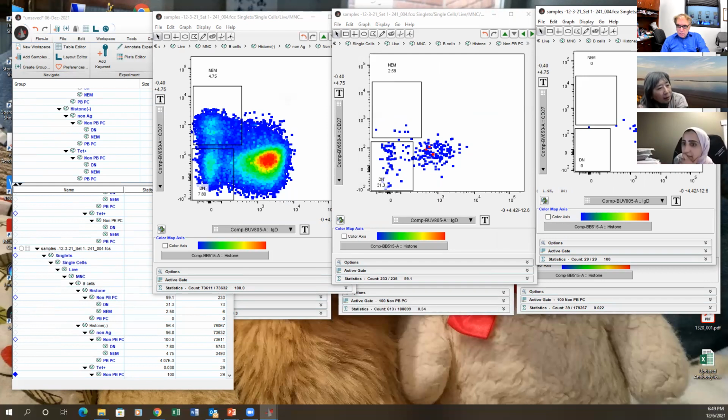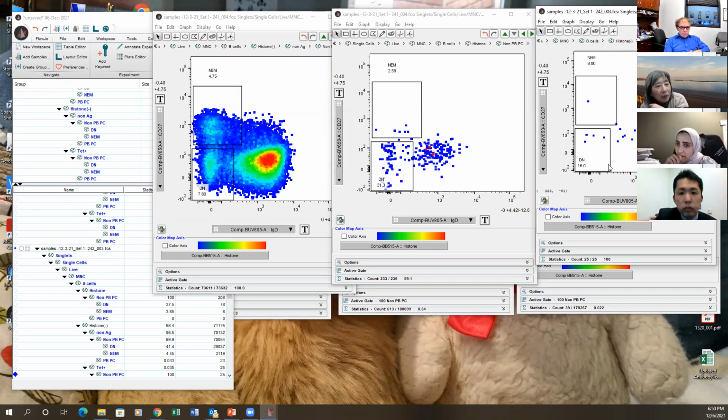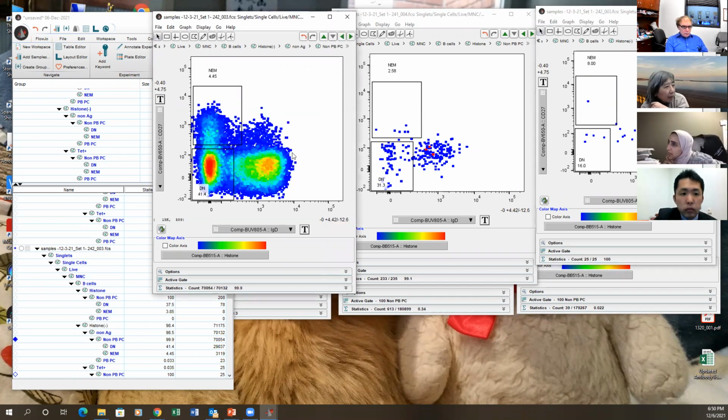This is the paper, unless they downregulate that surface receptor. That's what happens when the B cell really reacts to SNRP, and once they bind to it, they downregulate. So in a double negative state, you don't detect any. That's possible. No, I'm just saying why two samples are like that. That's possible, but let's just go with the simple. I think that's hard enough to do this experiment. Oh, wait a minute. So this sample is 16. Oh, but I think I'm right. The total is 41. That's true.